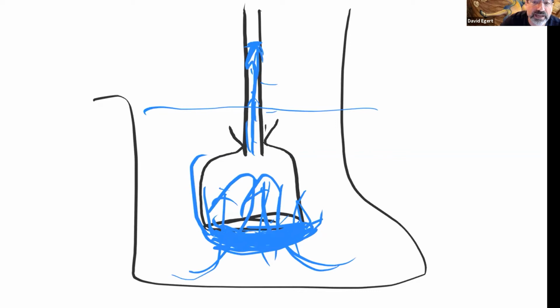It looks like it's speeding up, and then we start seeing the real thing where it's starting to slow down, because in reality, it's been slowing down all along. It's just that the initial influx of water did not go up the tube. Instead, it kind of tightened things up and swelled things out. That's my guess of why the data looks like it does.